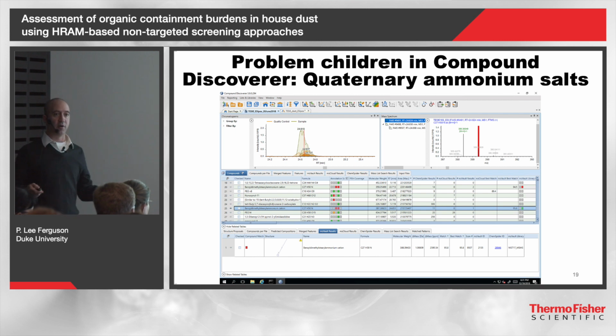In this case, there are no adducts. You get a single peak. And so when Compound Discoverer sees that single peak, it's going to assign it as M+H. It's actually not. It's an M+. And so as you can see, in the MS1 spectrum here, it's actually giving you this red line where the peak should be, but it's actually 1 Dalton lower.